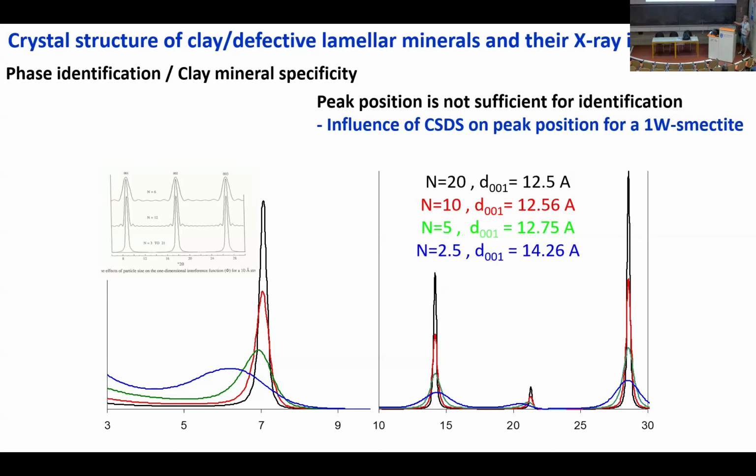So I have no shift of the diffraction peak depending on peak breadth. But in this region here, I see that change. So is the change I'm seeing in the low angle region related only to peak broadening, decreasing of crystal size, delamination, or is it really due to something specific, to a change of the layer to layer distance?